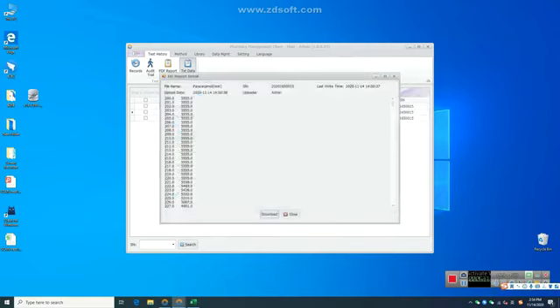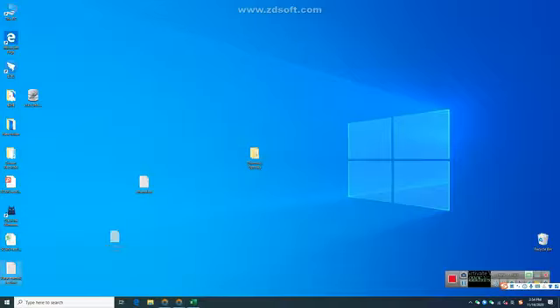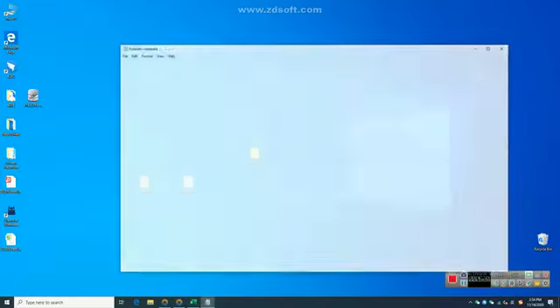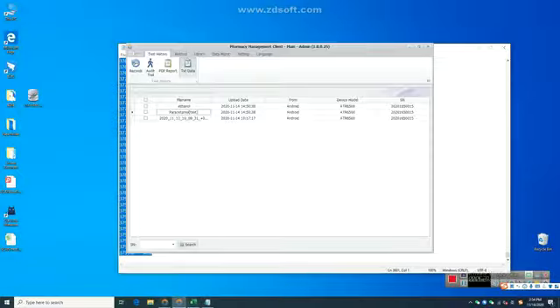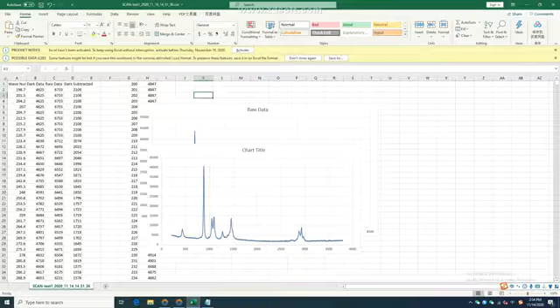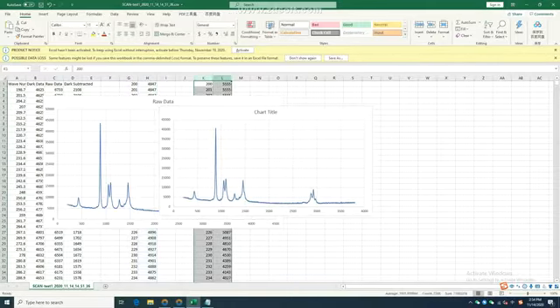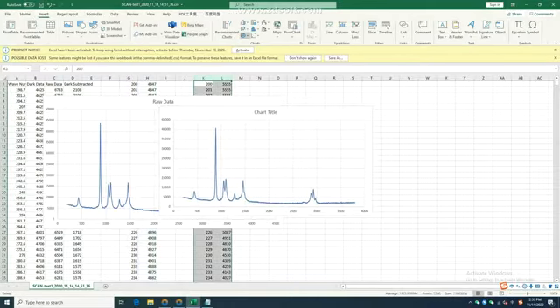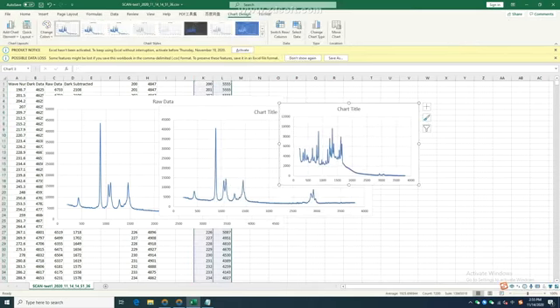You can select the scatter and draft it. You see the graph database with the Excel has completed. We have completed test 9, Pharma ID data export test. Next, let's move to test 10, Pharma ID reporting test.